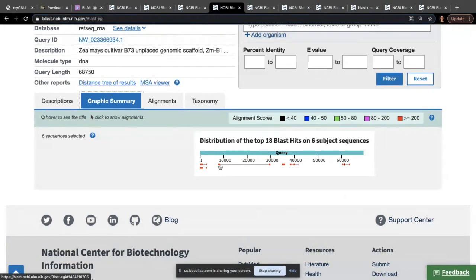Okay, so this is the uncharacterized locus mRNA. It's the same one here. And it could be that the reason why it doesn't match this sequence is because there is DNA here that doesn't exist in the mRNA. So it could be that this whole chunk is an intron. And then here, lots of tiny exons and lots of introns.